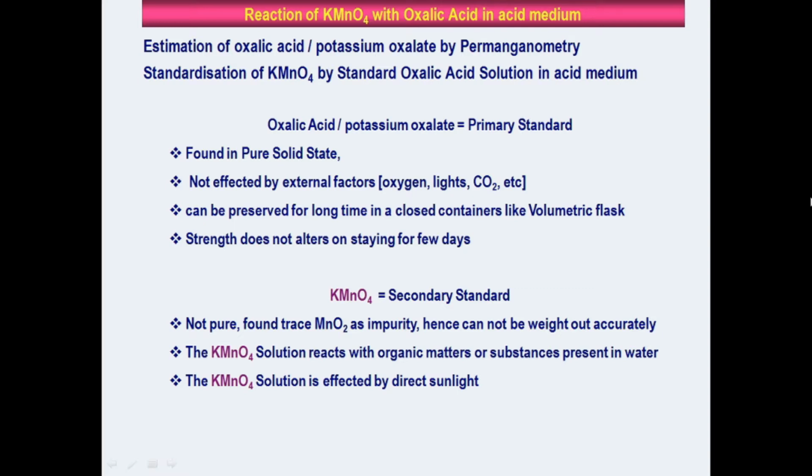Before going into details of this reaction, I would like to discuss some features of oxalic acid as well as KMnO4.